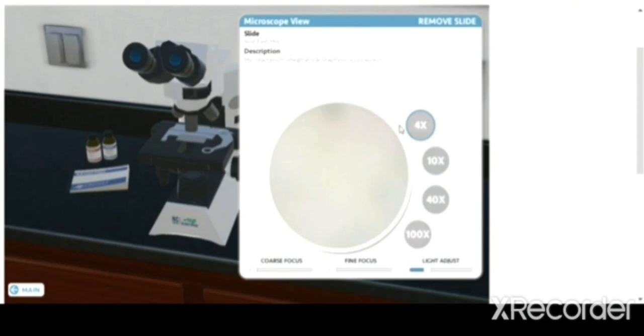To begin the experiment, smear the specimen directly onto the slide. Then let it air dry. Once the specimen has air dried, you can now move on to the next step. Using the Ziehl-Neelsen method, use heat to infuse the carbol fuchsin into the acid-fast cells. You can use a Bunsen burner for this. Once this is done, you can now begin staining. After you are done staining, you can now place your slide under the microscope.